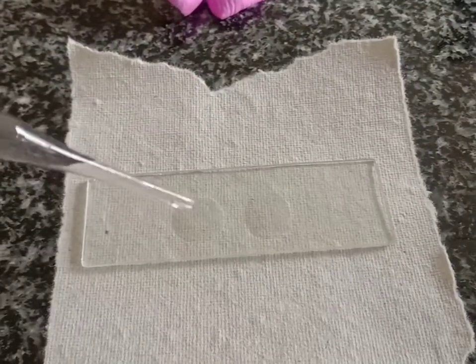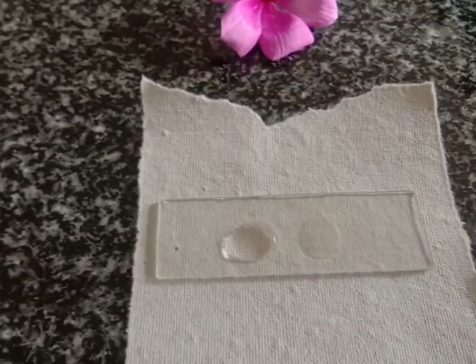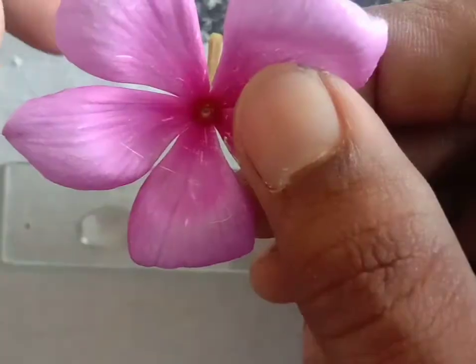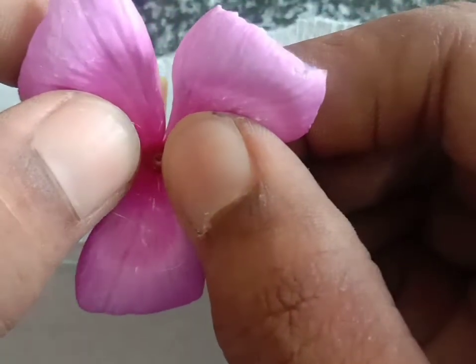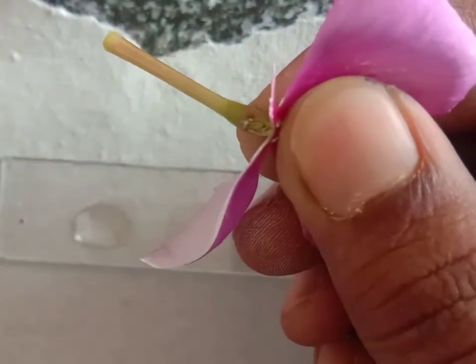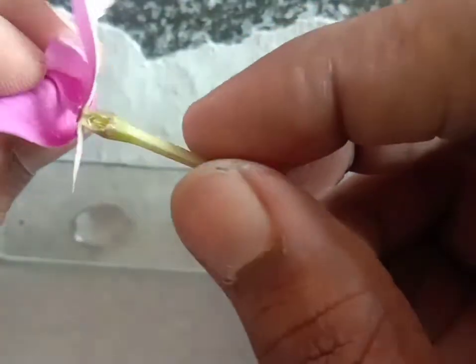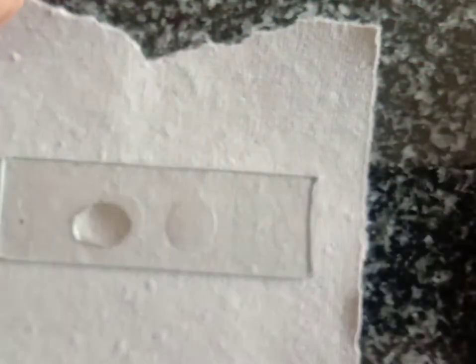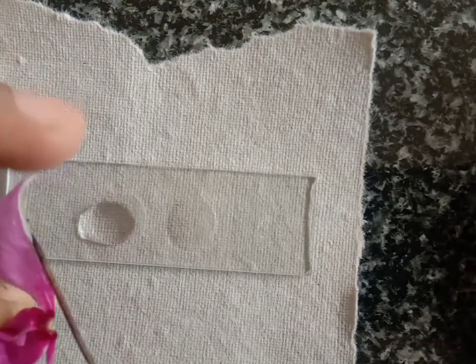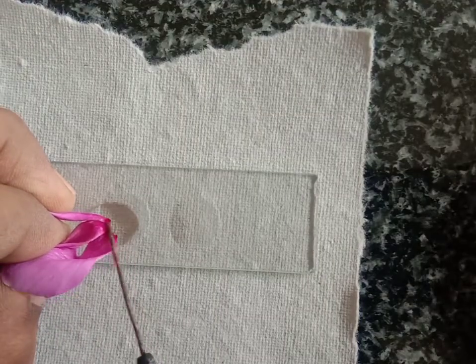Take 1 to 2 drops on the slide and take a Vinca rosea flower as a pollen source. Tear the flower like this. Now take a needle and dust the pollen grains on the slide with the help of the needle.